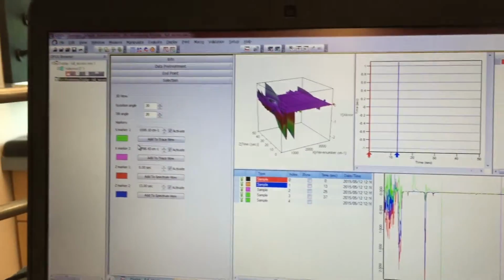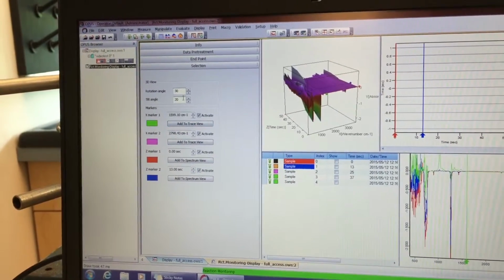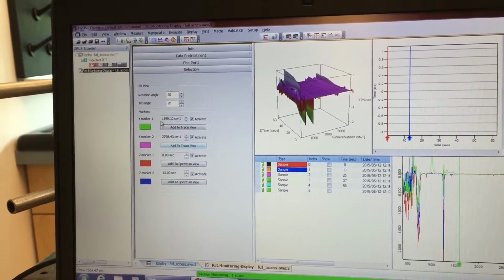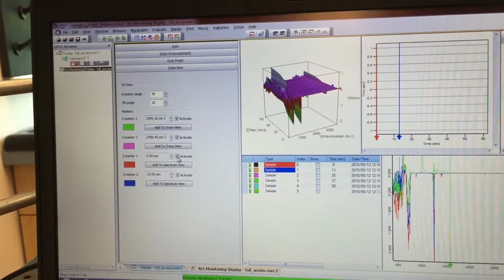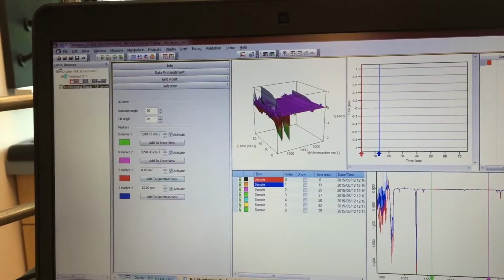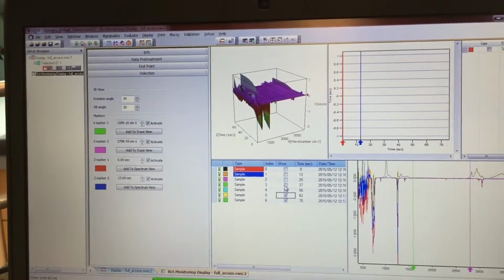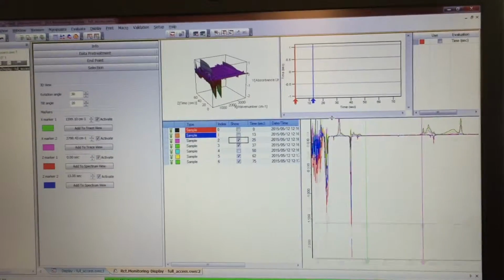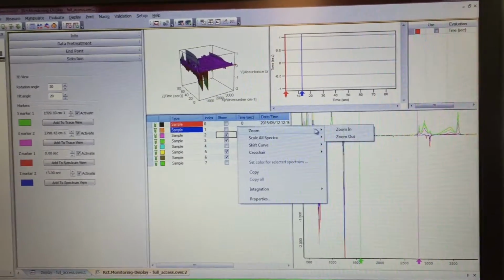This area right here also has some information for you. These are rotation angles and tilt angles for your 3D plot. It has markers, so this blue marker here and this red marker, we can deactivate them, we can activate them. You can also change what these markers indicate. So let's select a few of these. Now they're all going to be displayed here. Let's make this window a bit bigger so we can see better. And let's zoom in.